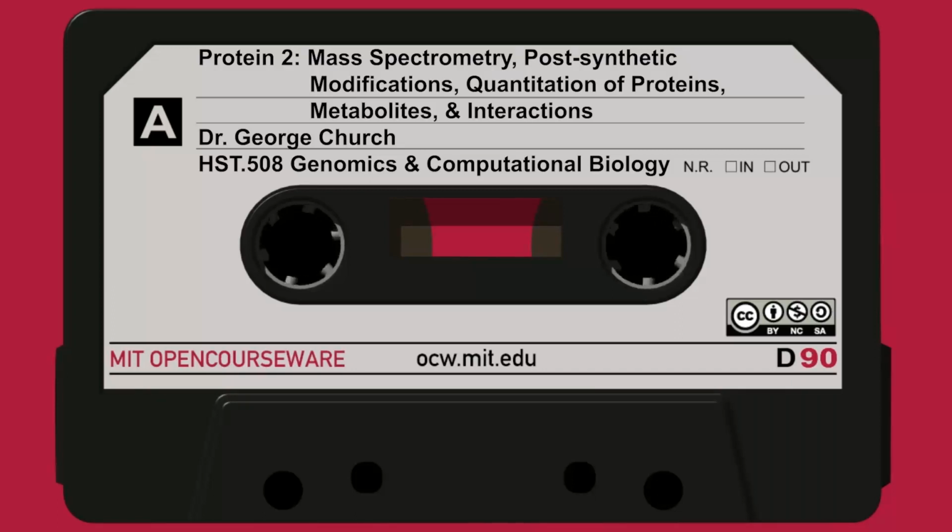So here we had, in a certain sense, 5 or so dimensions: the sedimentation, which is the native complex size, the denatured protein subunit size, the peptide ion exchange, the peptide mass, and the peptide fragmentation. So when we talk about fragmentation, that's what MS/MS sometimes means. It means that you're doing first mass separation of the peptide, you break it up and you do another mass separation of the component parts. And that allows us to do database searching and sequencing of the peptides.